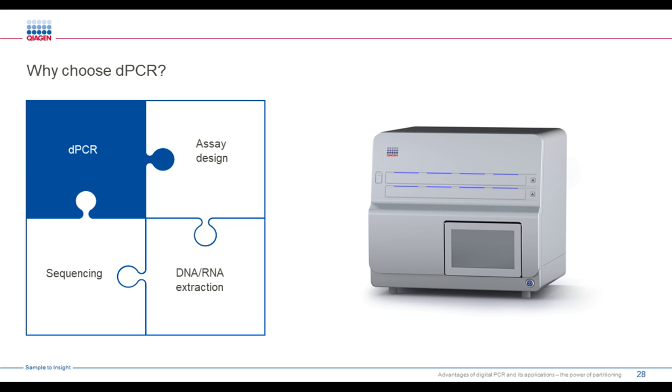So of course you need to first be able to extract DNA or RNA, so you can either do cDNA or make a library for sequencing. And of course you need to be able to create an assay and perform the digital PCR. But as I said, anything you can extract DNA from and create an assay for, you can do digital PCR. It doesn't matter if you have crude samples anymore because of this partitioning, as I have been talking to you about today.